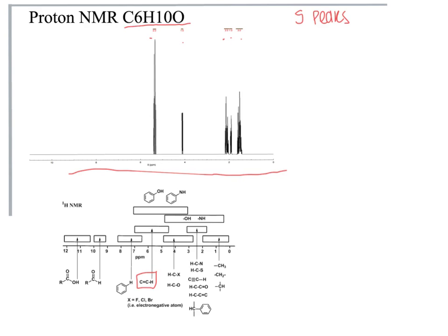The second peak falls into around 4.1, which shows the presence of an alcohol bond between carbon and oxygen, which we have, as we have an oxygen in our compound according to the molecular formula.